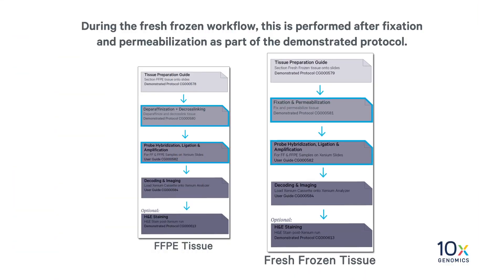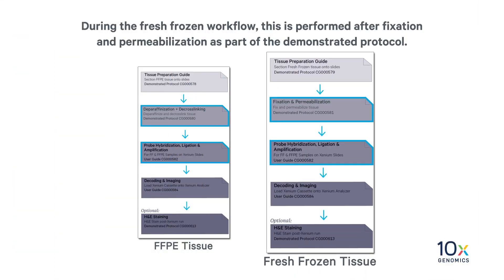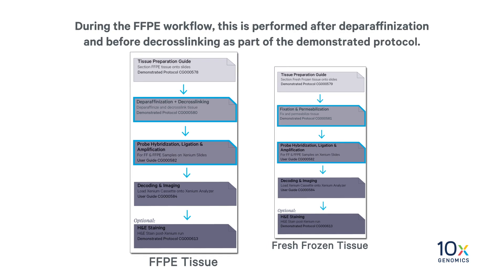In this video, we will highlight cassette assembly and pipetting techniques that are used throughout the Xenium protocols. During the fresh frozen workflow, this is performed after fixation and permeabilization as part of the demonstrated protocol. During the FFPE workflow, this is performed after deparaffinization and before decrosslinking as part of the demonstrated protocol.